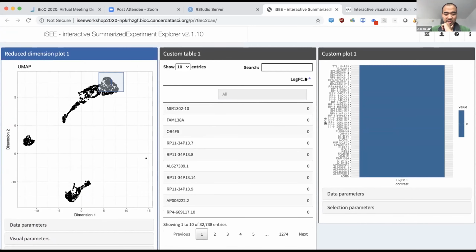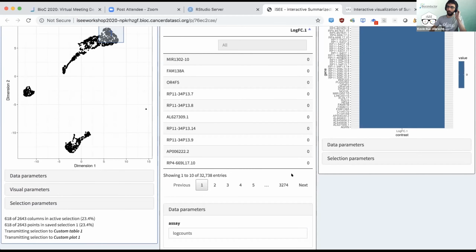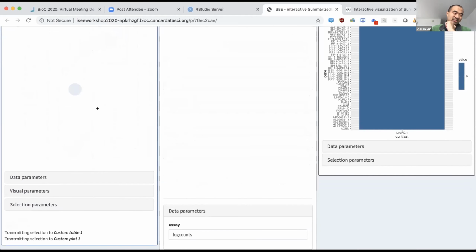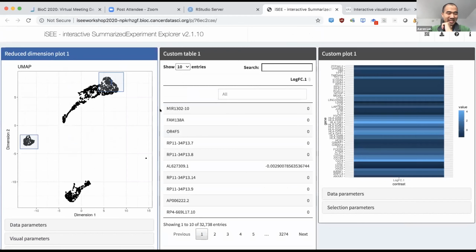So we could, okay, I guess it doesn't like that. No, you just have to do an active selection. It's going to do the fold change versus. Yeah, I get so confused. We have another panel that does exactly the same thing. That's better. Aaron develops the panels, and I remember them. Yes.